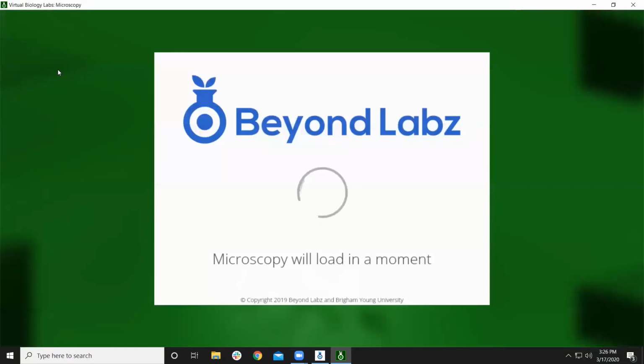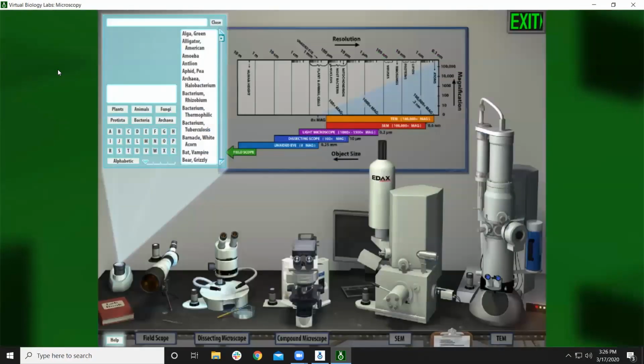So we have a microscopy lab, and each of the labs have these species selectors, all right? So what we've done is we've created a virtual world of these different kinds of species that represent all the different things going on in the world. So it's a small set, about 160 species. And you have different ways of organizing them. So all the species that start with B, for example, all the plants, or all the animals, or all the bacteria. And then you can organize them by characters.